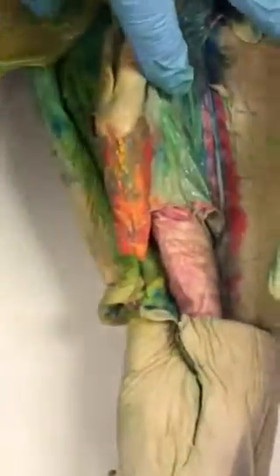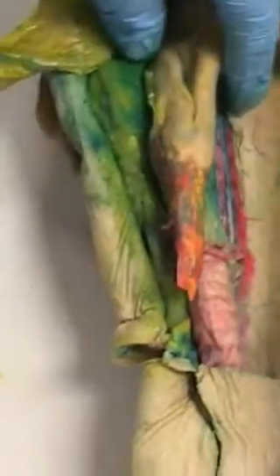Okay. That's actually yours is better than ours. We didn't we couldn't see that in ours. Ours was detached. Just tear it apart. Maybe. Well, ours was so pregnant that everything exploded. No, I didn't get the cardinal ones on mine, so I don't have.